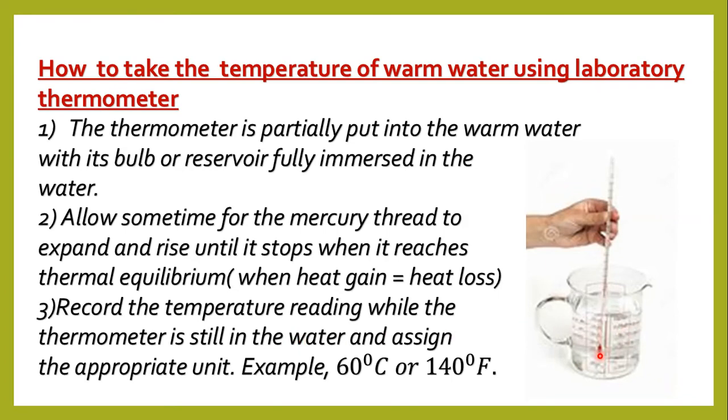Now, unlike the clinical thermometer, the laboratory thermometer, as soon as it is removed from the warm water, begins to lose heat to the environment and the mercury thread will drop. So you will not be able to record the actual temperature of the warm water. So it should still be in the warm water before the reading is taken.